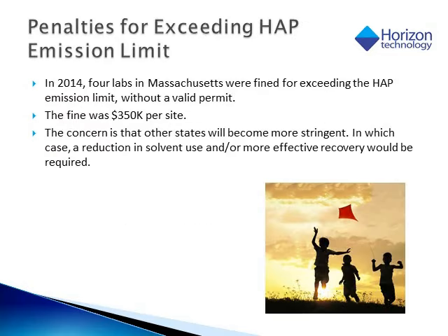In 2014, 4 labs in Massachusetts were fined for exceeding the HAP emission limit without a valid permit. The fine was $350,000 per site. The concern is that other states will become more stringent, in which case a reduction in solvent use and/or more effective recovery would be required.